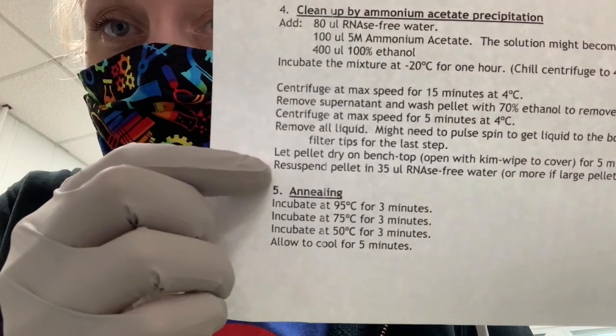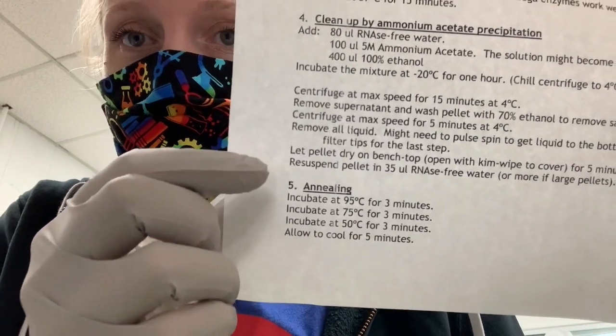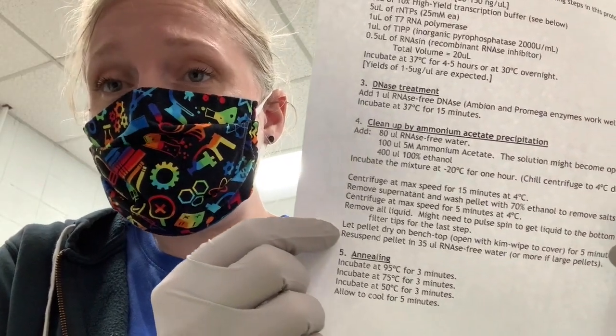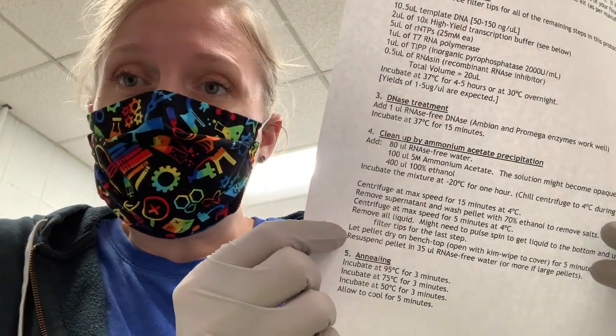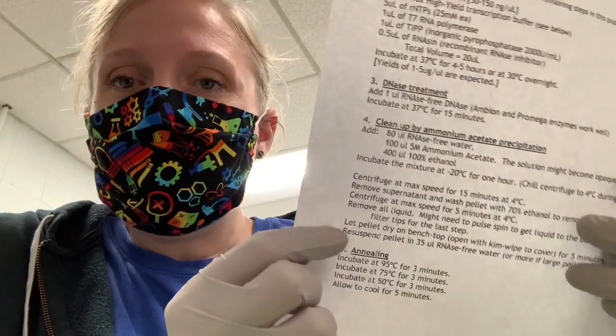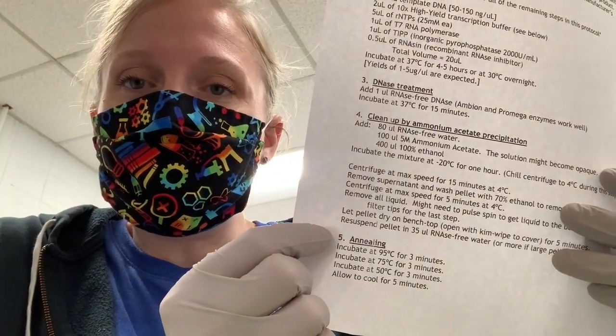The next step of this protocol, so at this point you've purified your double-stranded RNA, and you can change the volume of water you add. So if you don't think you have very much, you could add less. If you have done double reactions or you have really big pellets, you might need to add more. The next step, number 5, is annealing. And although you've made double-stranded RNA, i.e.